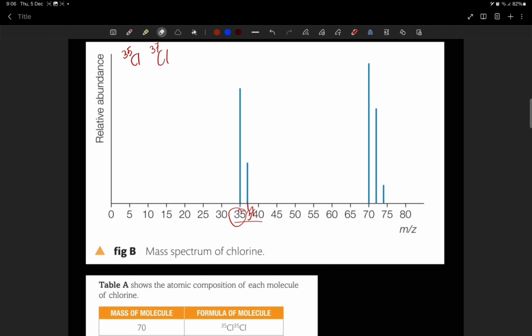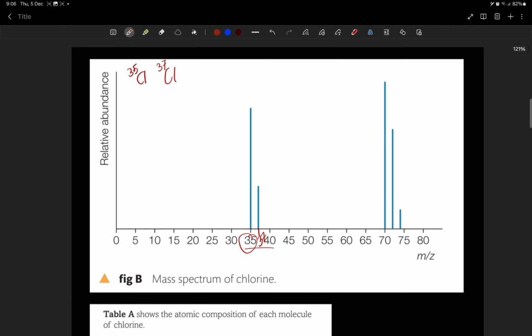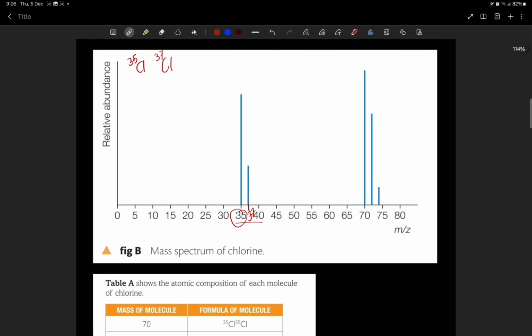If I said ions for both, you'd be confused. Okay, you can either do it approximately by eye, or to be more accurate you can get a scale and put the ruler here like this. Okay, oh, that's an ugly scale. Okay, and you see the height of both things and you compare them.